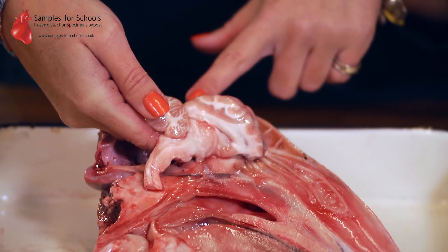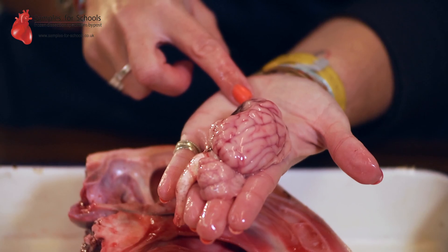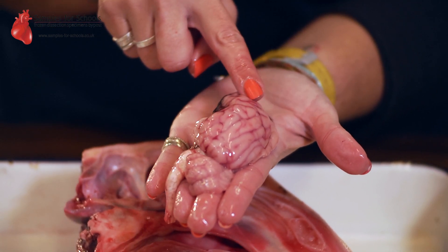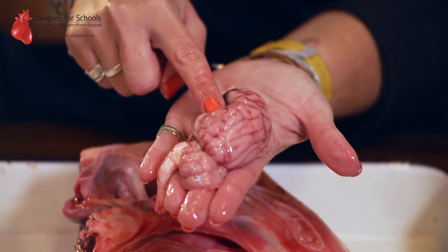Once you've loosened the brain from its cavity you should be able to remove the whole specimen intact. When looking at the sheep's brain you'll notice that it is folded — this increases surface area. The raised parts are the gyri, the sunken dips being sulci.